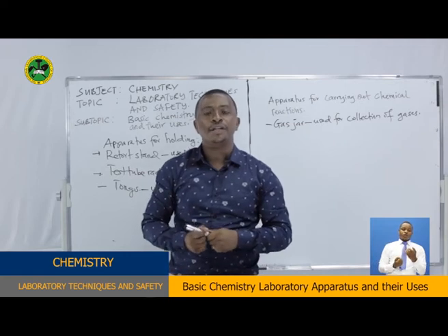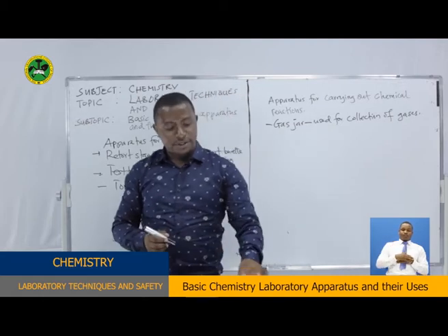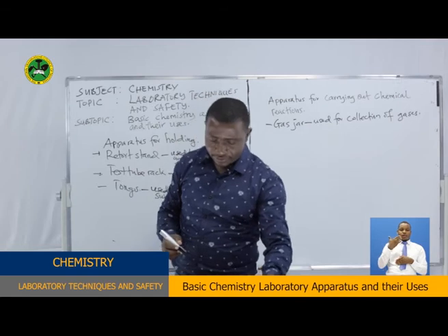Oxygen is always collected in a gas jar. So this is the gas jar used for collection of gases.